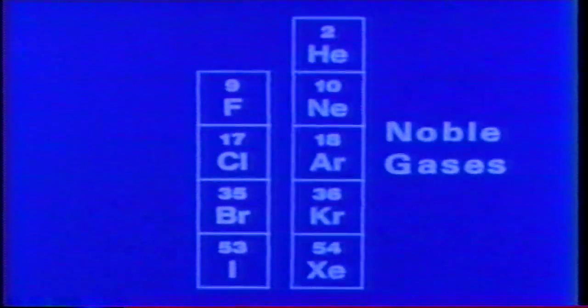The bromine compound acts similarly, as does the iodine. When water is placed on the hydrogen compound, it gives a rapid evolution of gas. Again, all but the hydrogen compound are similar. Thus, hydrogen is not usually included in this family of reactive and chemically similar nonmetals, each with one less electron than a noble gas.